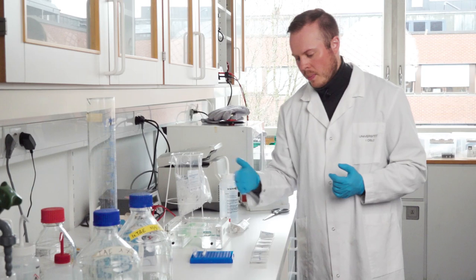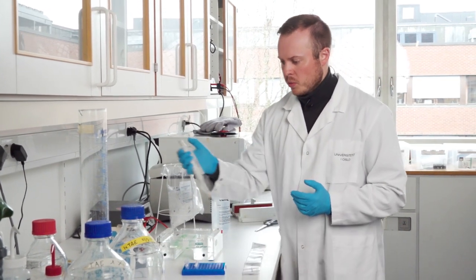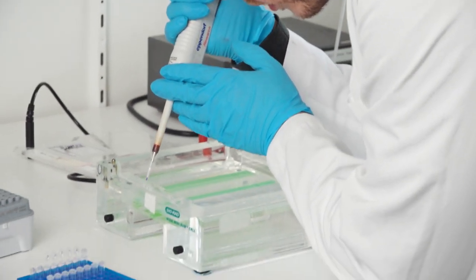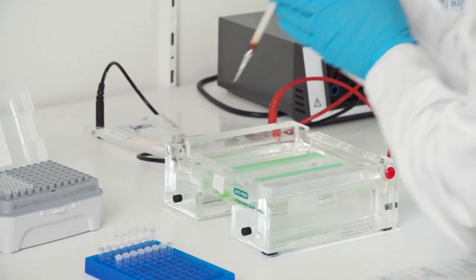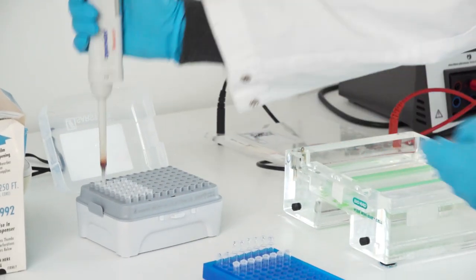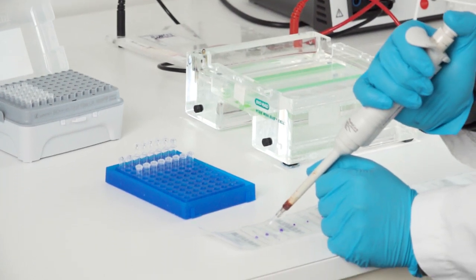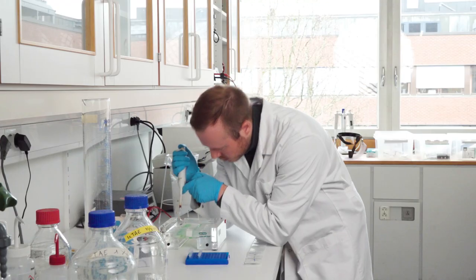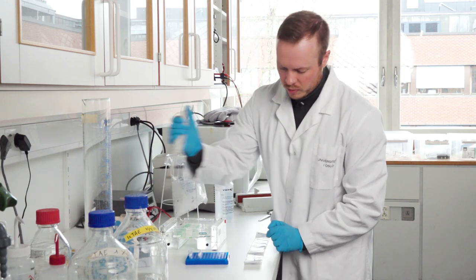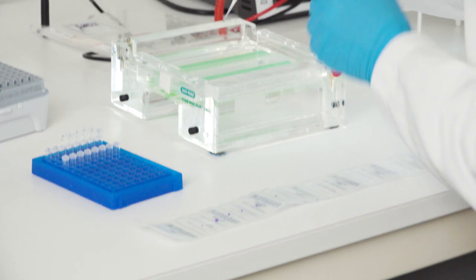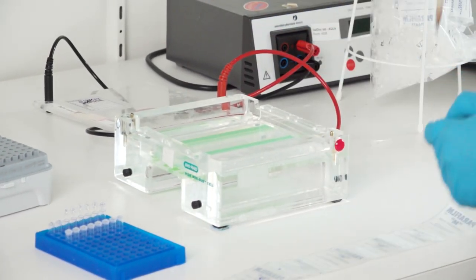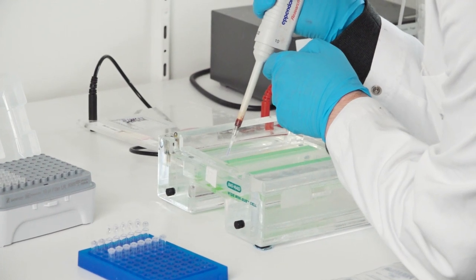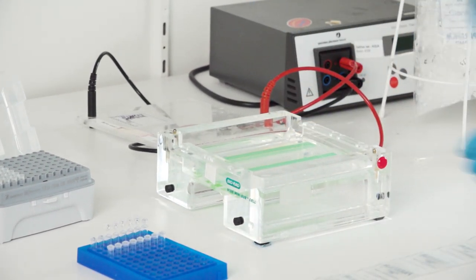So the next thing is loading the samples into the gel. And here I prefer to take in the ladder first. So I suck it up, find the well I want, place it in, change tip. Then the first sample we had was the positive control. So I take the positive control first and place it inside. Then I take the negative control second, place it in the well, change tip. Then one of the real samples, place it in. And then you fill all the wells you need.